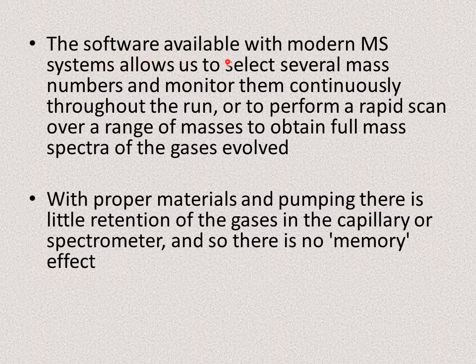Software is also available with modern mass spectrometric instruments. These allow us to select several mass numbers and monitor them continuously throughout the run.